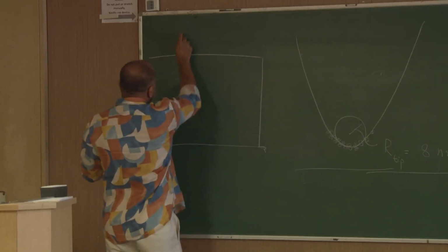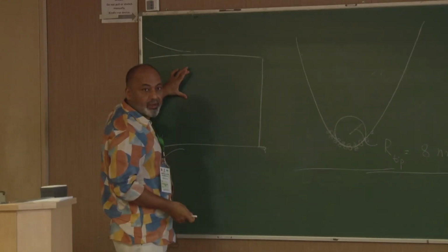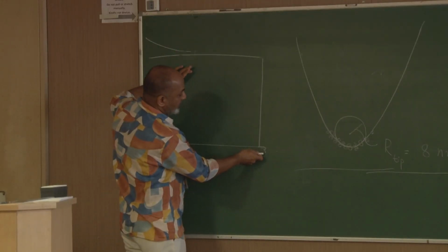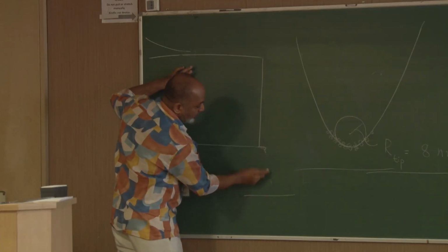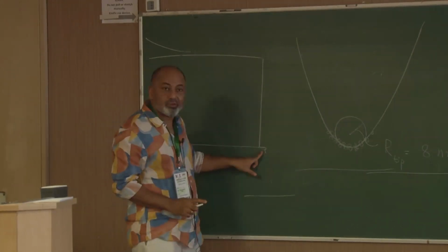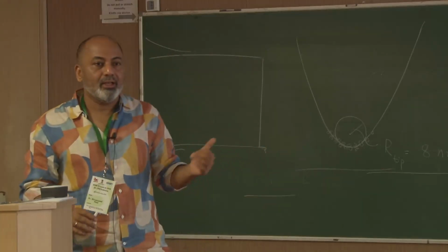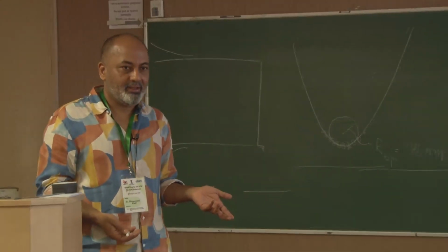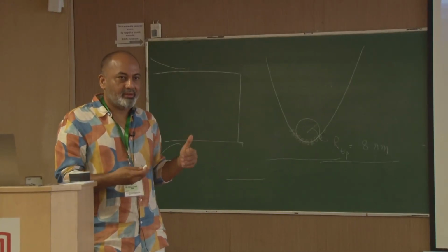So if I clamp here, let us say, and hold this object in a spring, and I tilt it a little bit, which is what is done in AFM, and bring it closer to the surface, it will interact, and this guy only will bend, not this. So it is the force constant only of this guy, because the force constant of the other guy is almost infinite, and you can say they are in series.